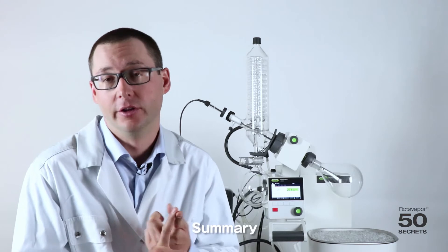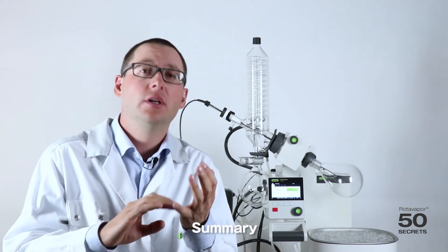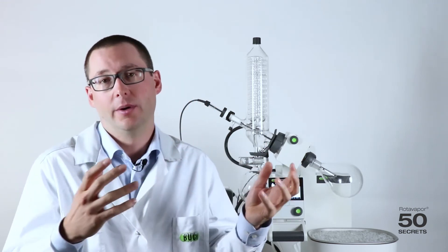So now after I have explained the solvent library on the i300 Pro and on the i300, I would like to quickly summarize. The main advantage is to know which solvent you are using but you don't know what is the boiling point or what is the required vacuum. And of course the dynamic distillation. As I said before, you can just simply select the solvent, press start, and the system will do the distillation fully autonomous.